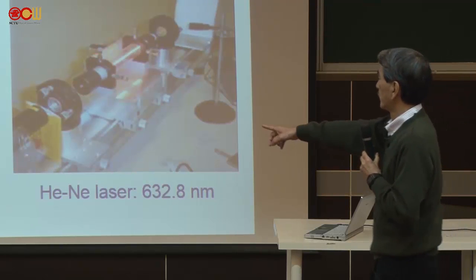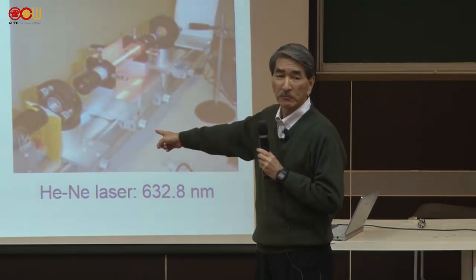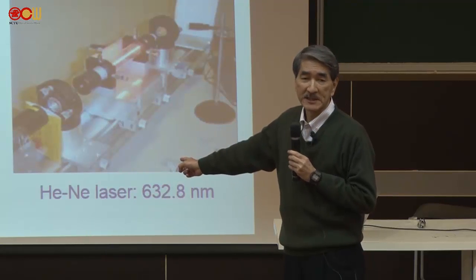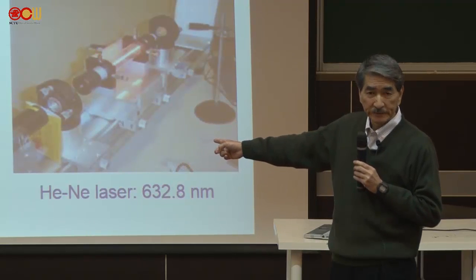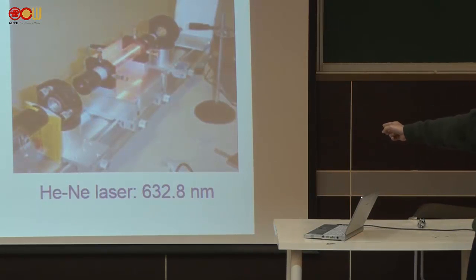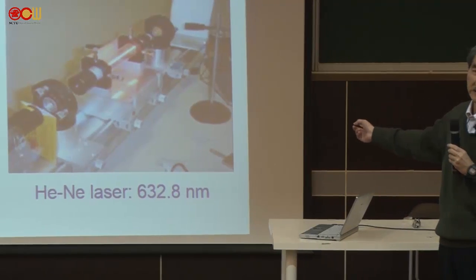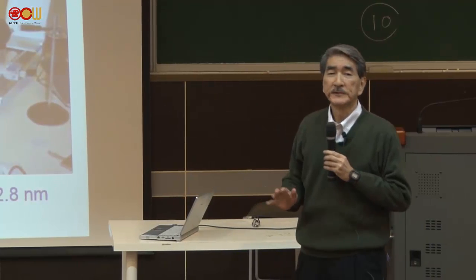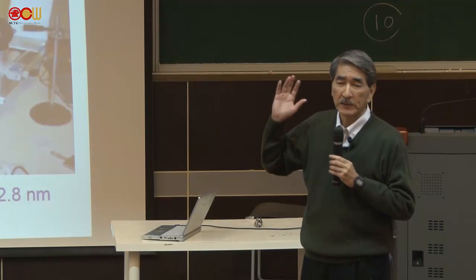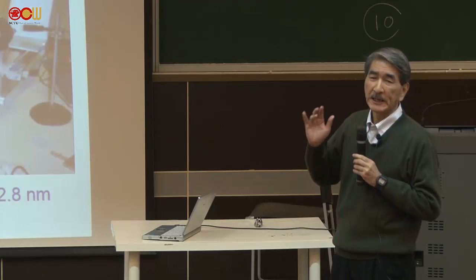And here I show you two very typical lasers. One is the argon ion laser that emits light at 488.0 nanometers. That's blue-green light. And here you have the helium neon laser that emits light at 632.8 nanometers. That's red light. And these lasers you often see in the chemistry laboratory doing Raman spectroscopy. So using lasers, we get some new eyes, which I call chemical eyes.